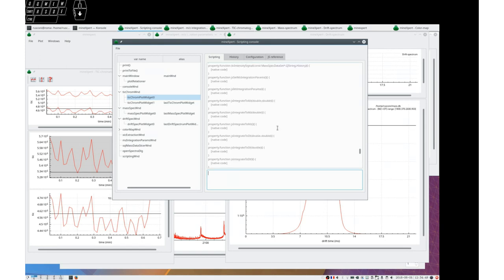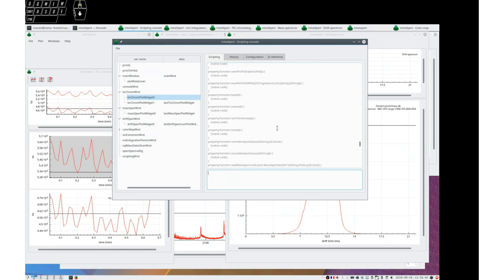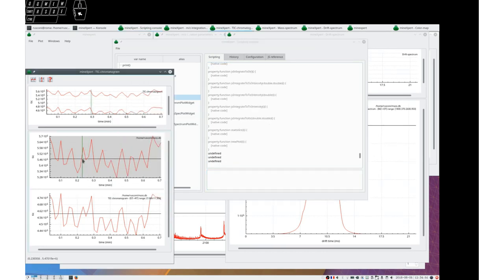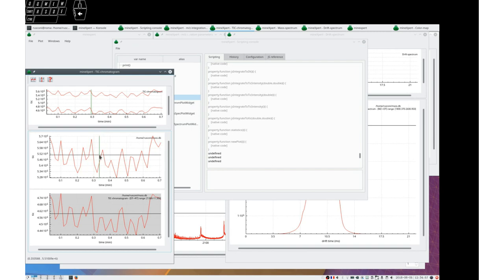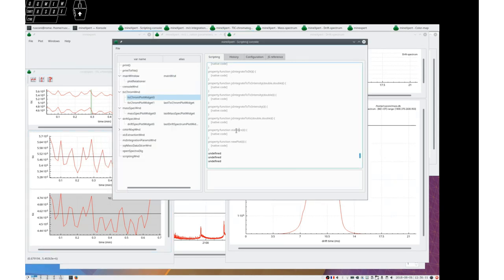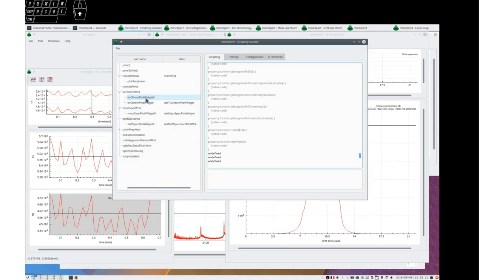Then we could, for example, ask that statistics be computed because we know that when a file is loaded, the statistics of all the mass spectra it contained are computed. So tick chromatograms have that function here. Let's ask that the statistics be computed.